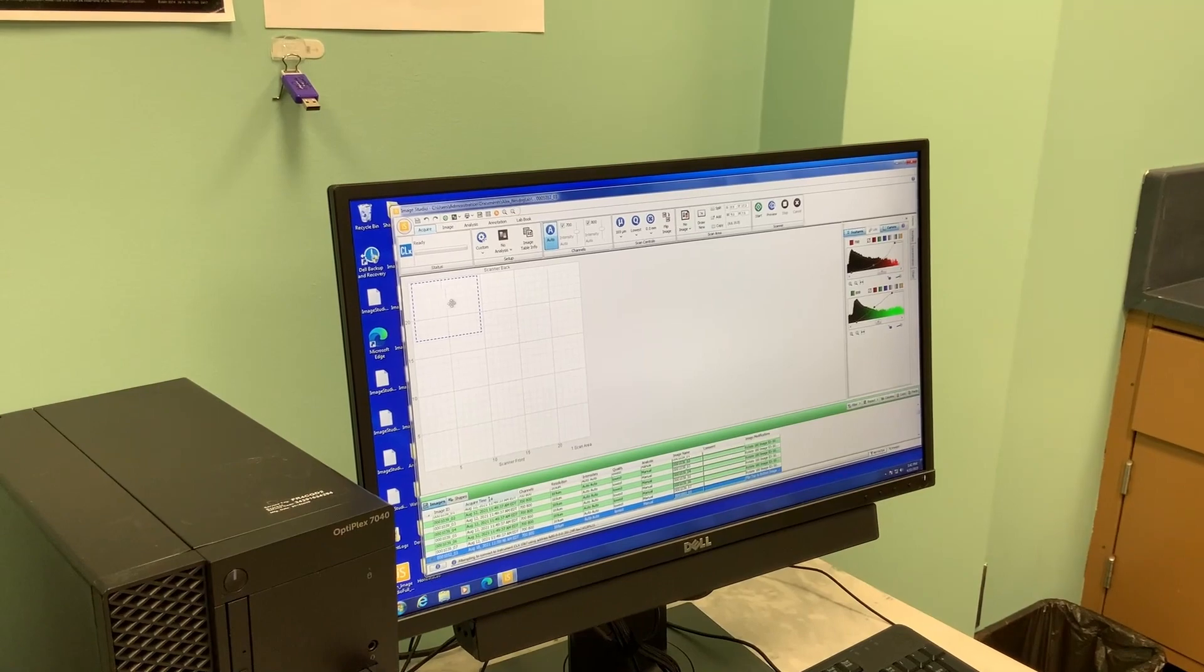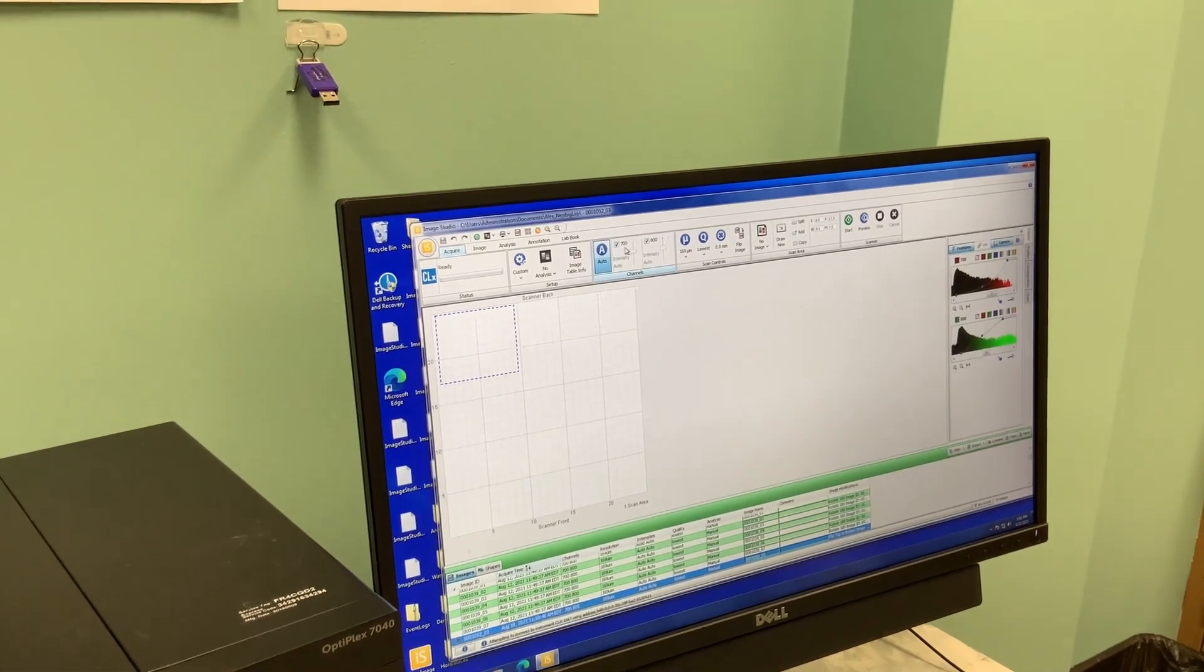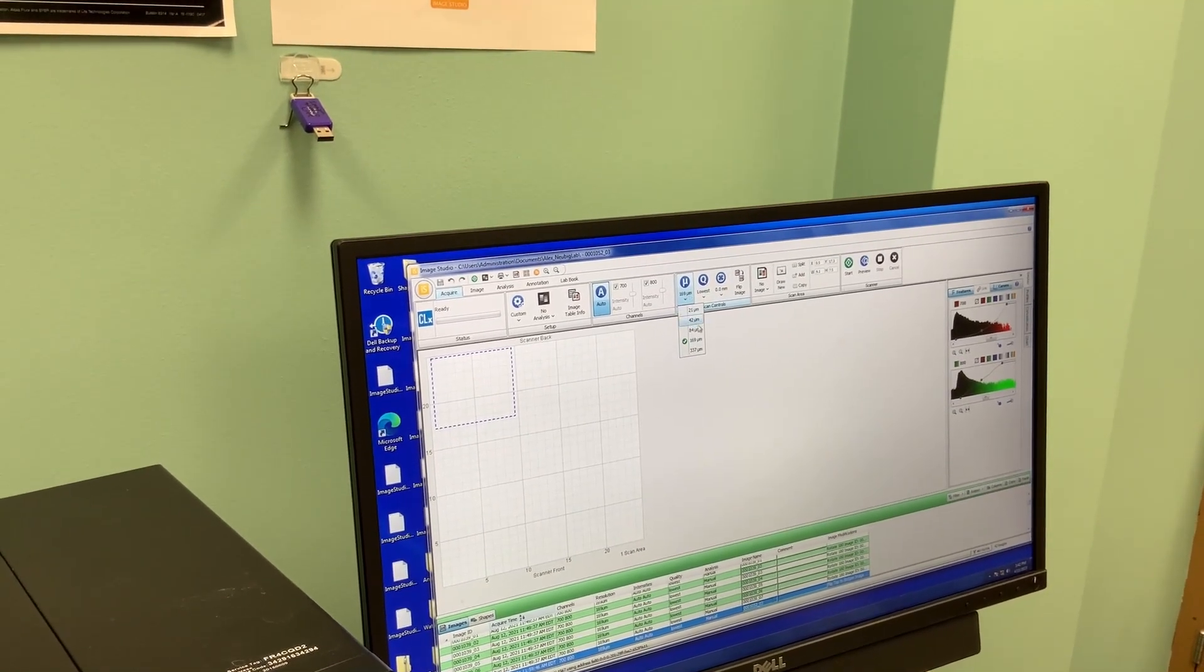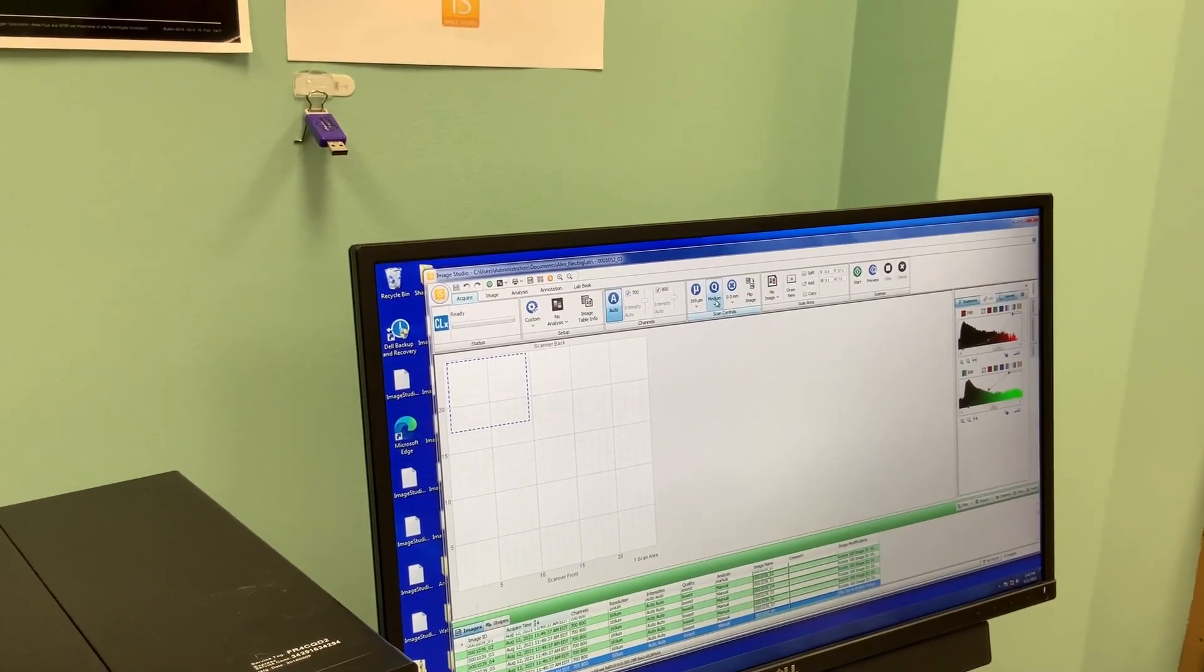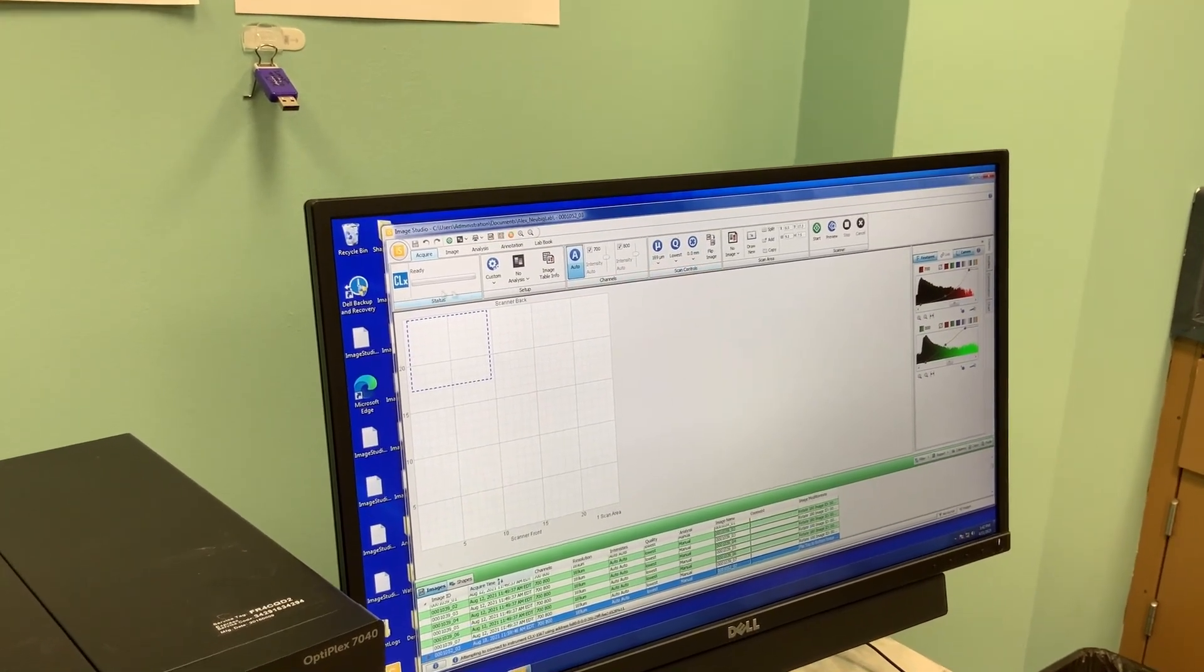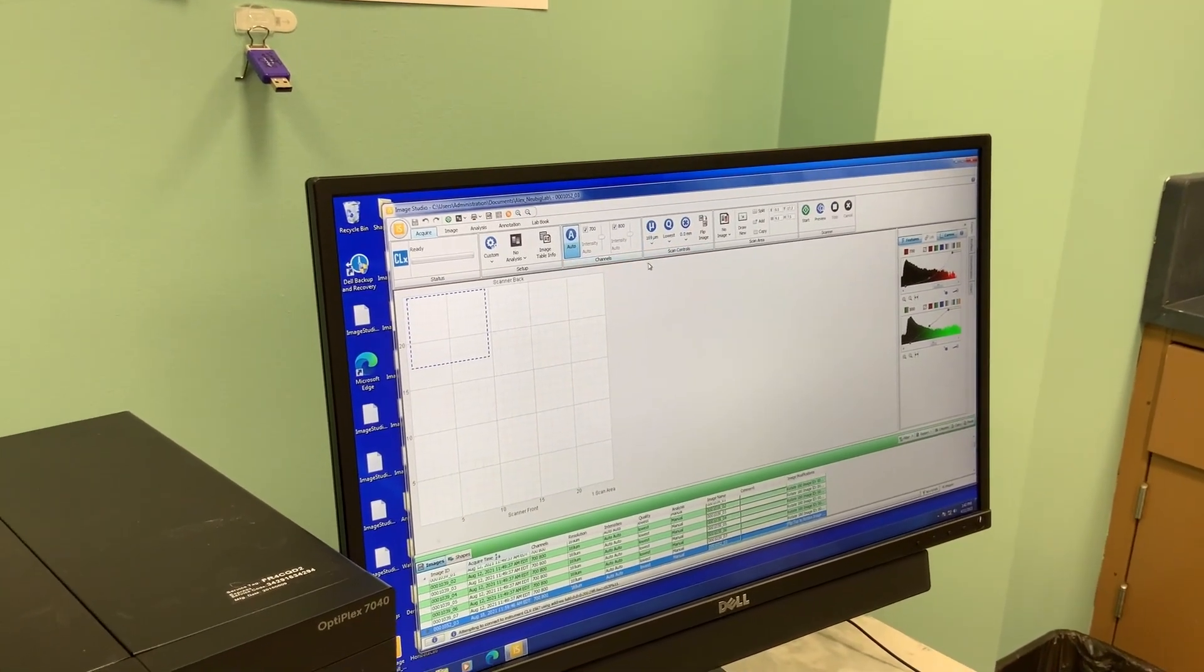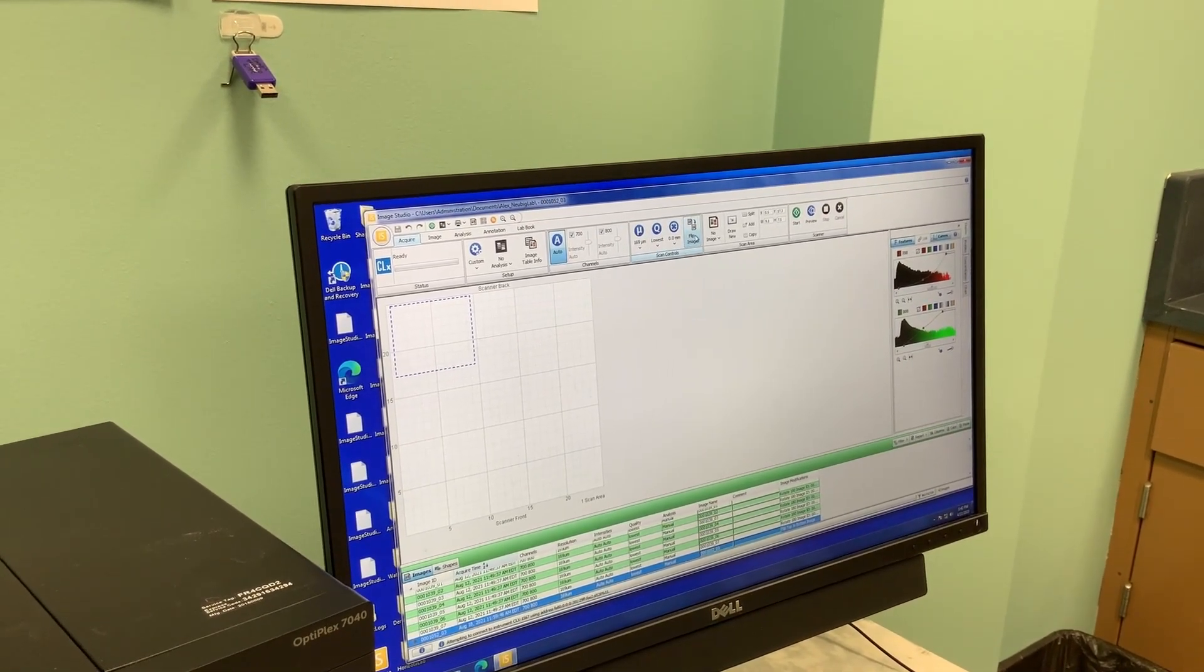Now that we've set the size of our region, we can go through these different settings. We want to keep 700 and 800 both checked so we read at both channels. This is the quality. Right now I have it on a low quality, but you can increase this if you're going to take a publication blot and you can also increase the resolution here.